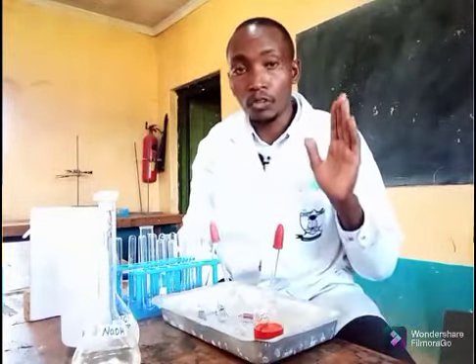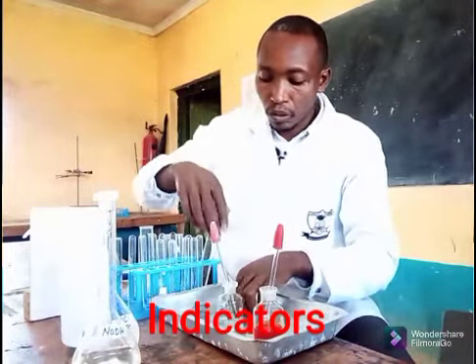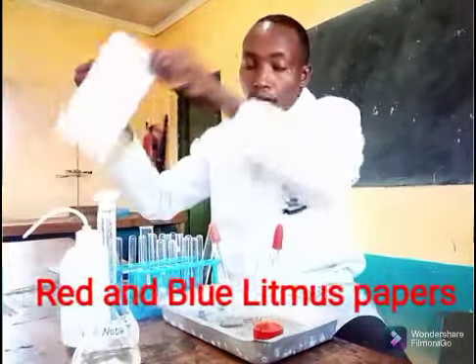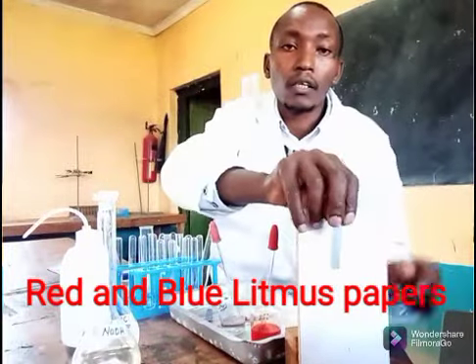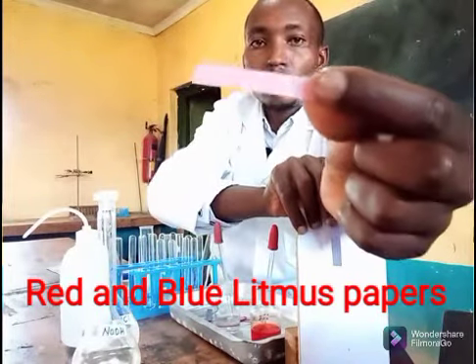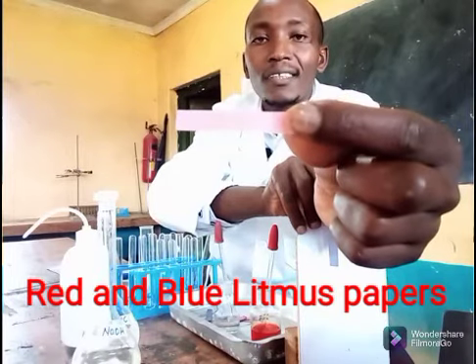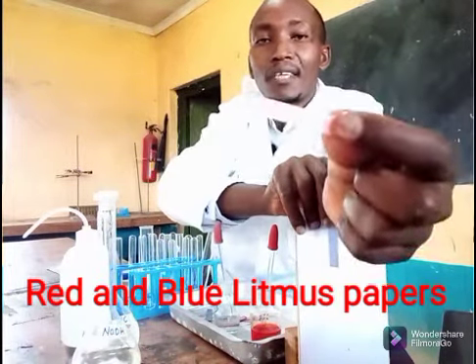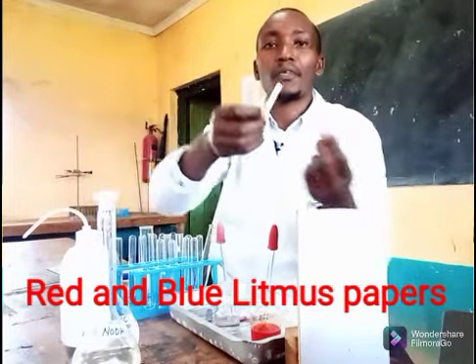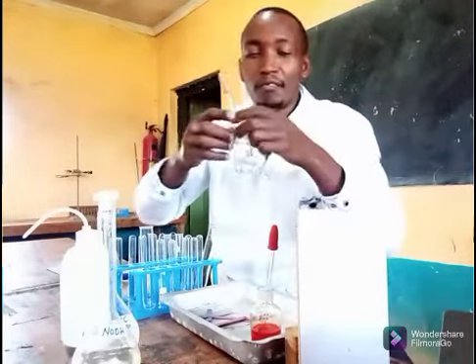It's an alkaline solution. And for today, I'm going to use three different types of indicator. I'm going to use some pieces of paper I have here, and I'm using the white space here to help contrast. I have two pieces of paper. This one appears pink, but we call it red litmus paper. And these are blue litmus paper. It's a form of indicator that we are going to use for today.